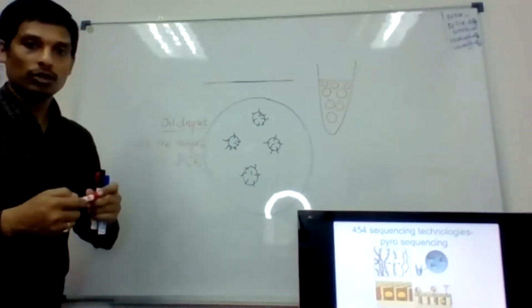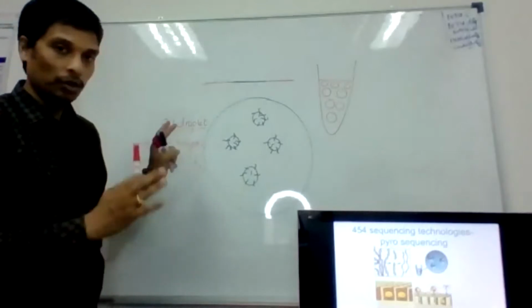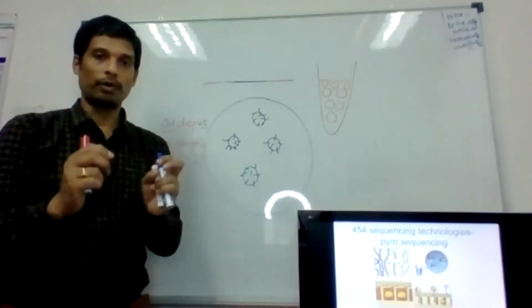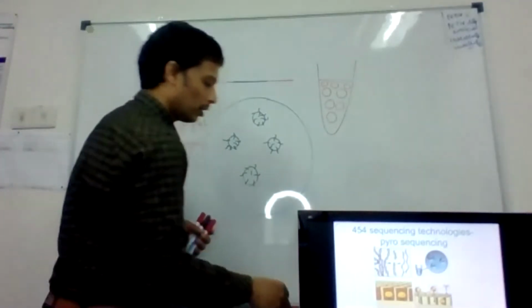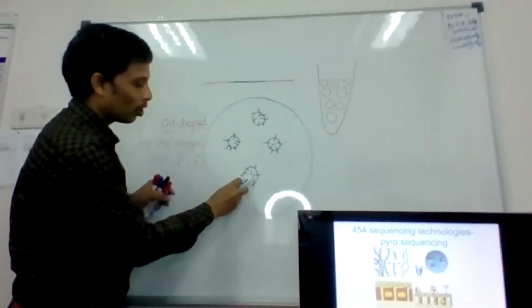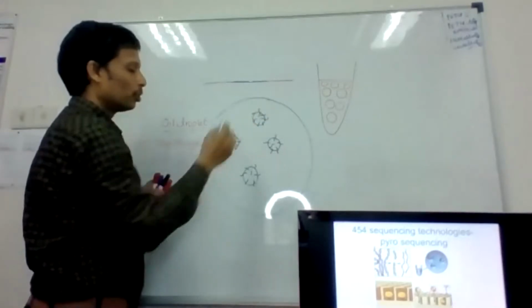So you understood already what is PCR, right? All the ingredients of PCR are present in this individual oil droplet, and each droplet has a lot of beads with immobilized primers. Another thing to understand here is that these oligos are complementary to this adapter.